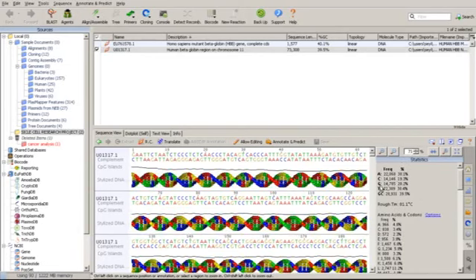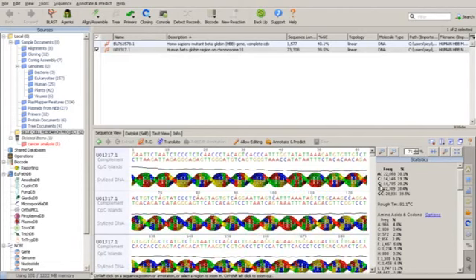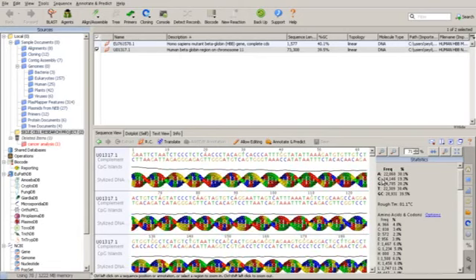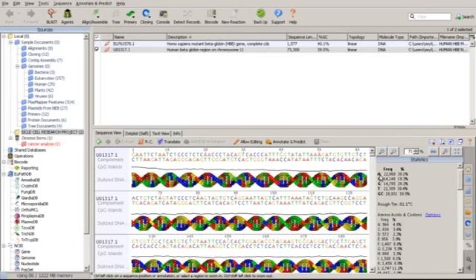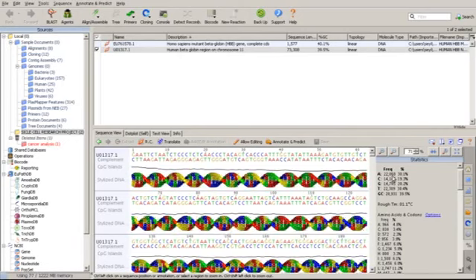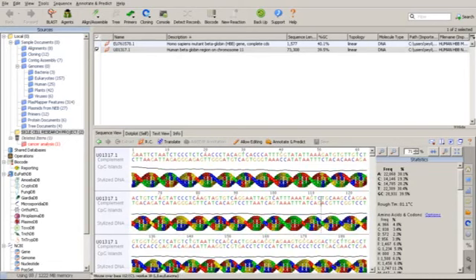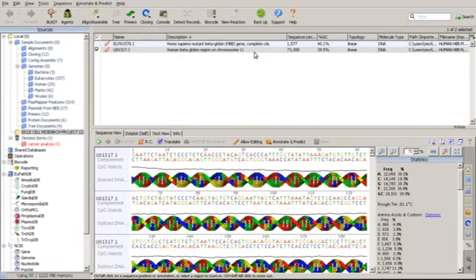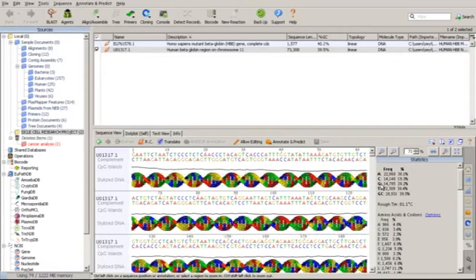Now all this signifies each nucleotide base. A is adenine, C is cytosine, G is guanine, T is thymine. That means there are about 22,068 adenine in the whole of this nucleotide sequence, and it's about 30.1% of the whole sequence. The same thing applies to cytosine, guanine, and thymine.